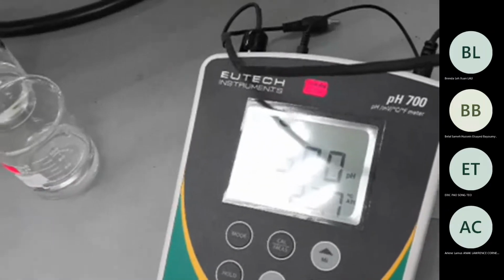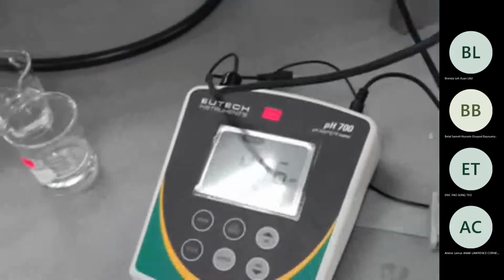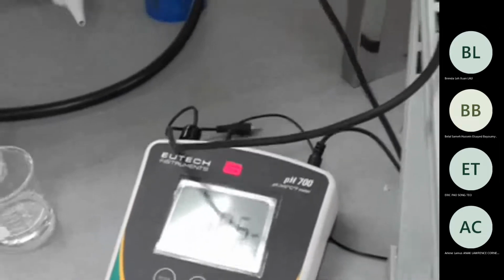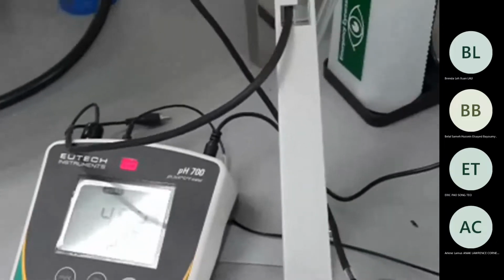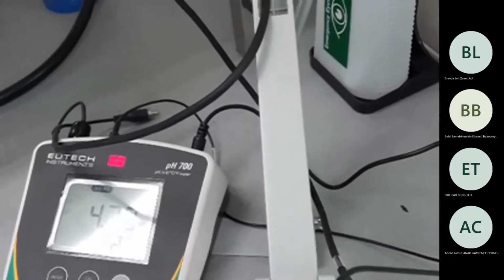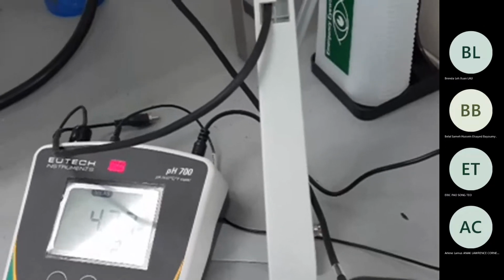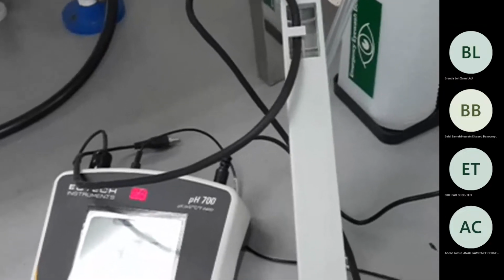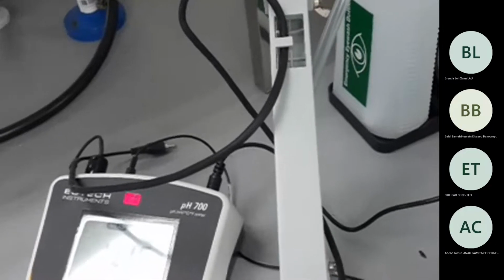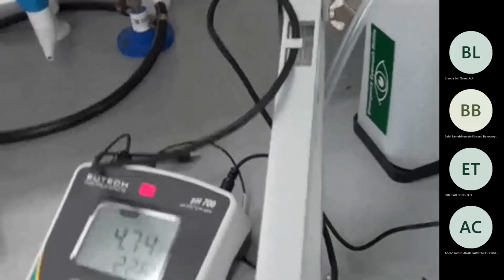It's going to be reduced more. We should use a glass rod only to stir, do not use this thing to stir it, never. It should be 4.7 around. It's reducing 0.01 at a time, so it should be okay. I think it is getting there soon.